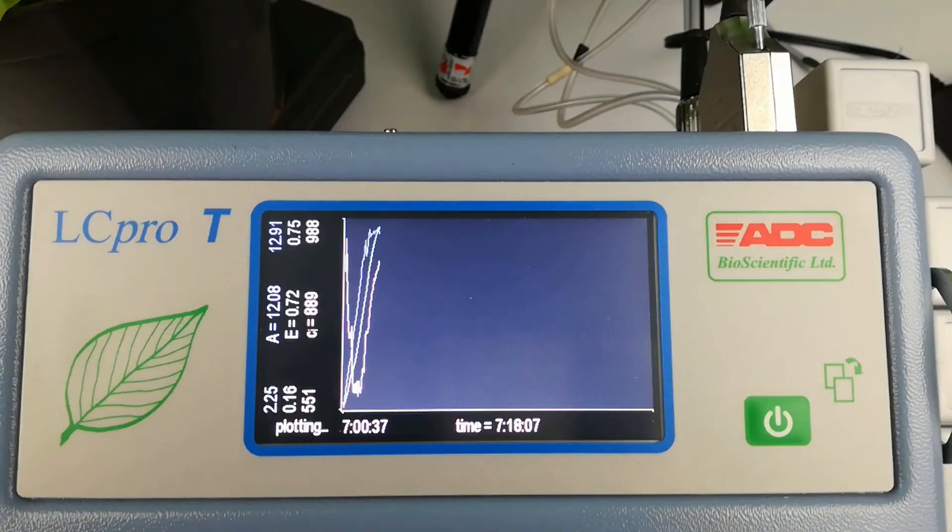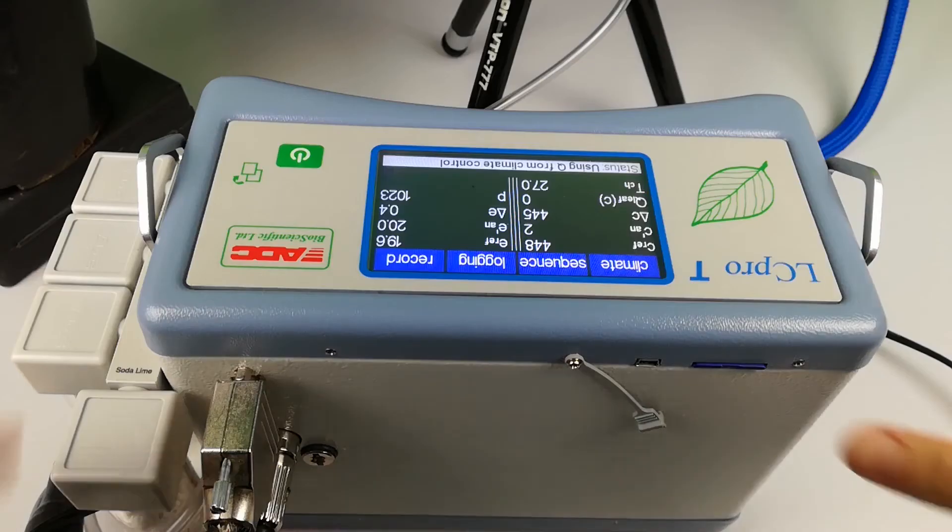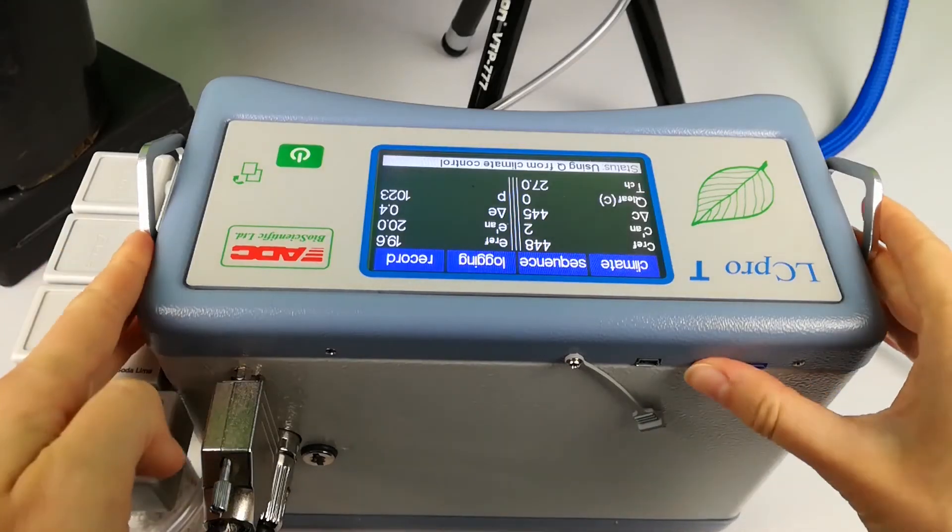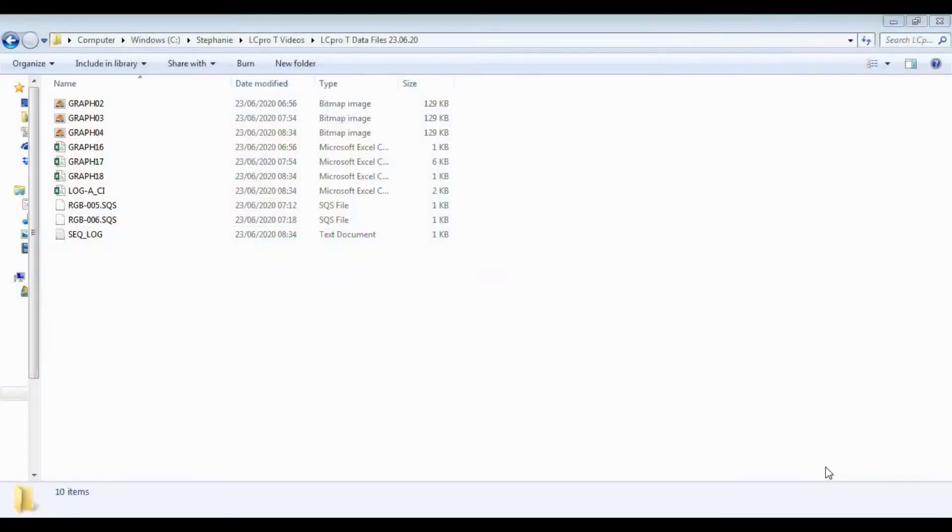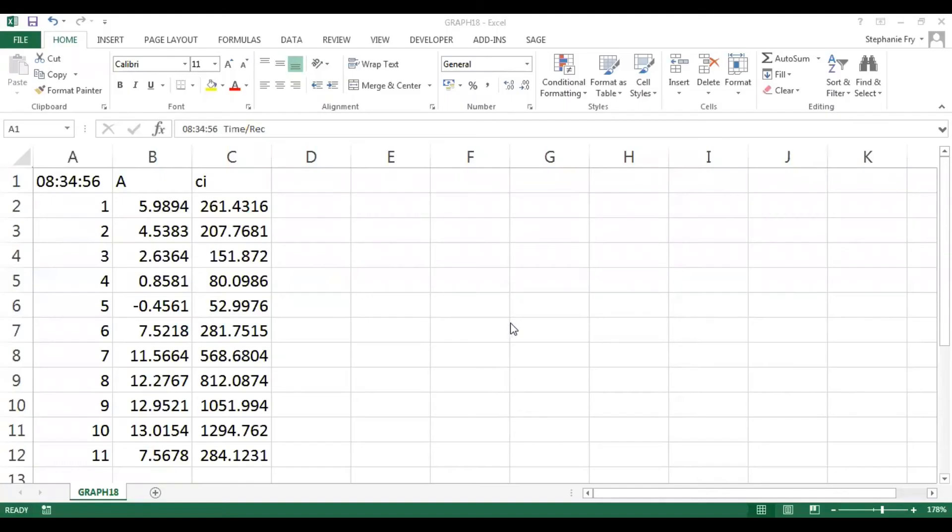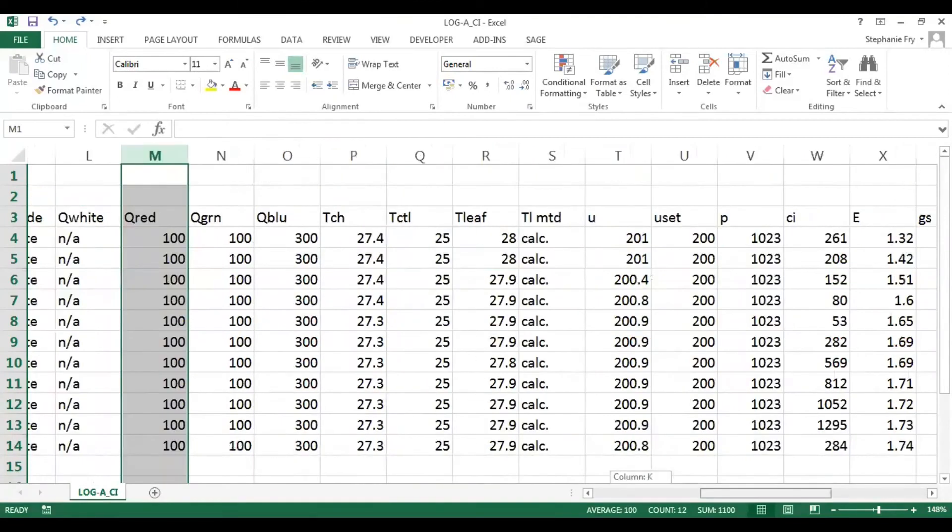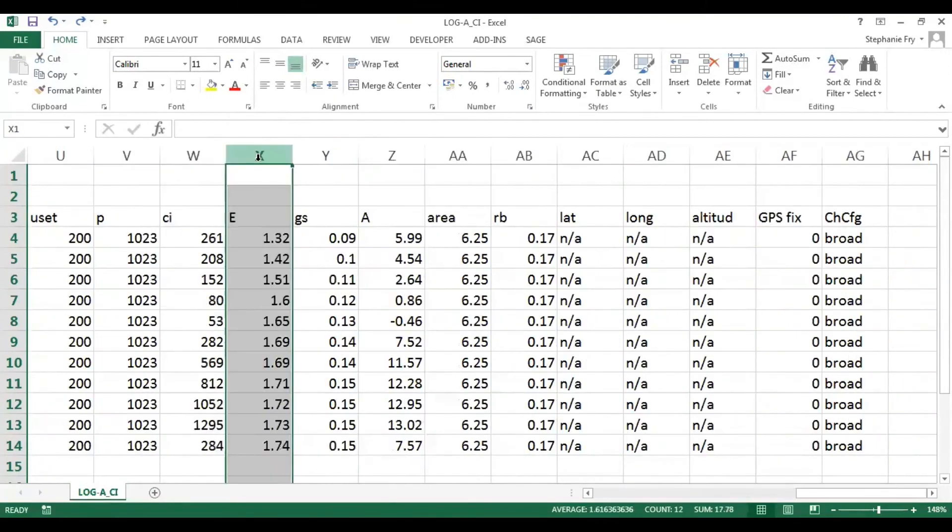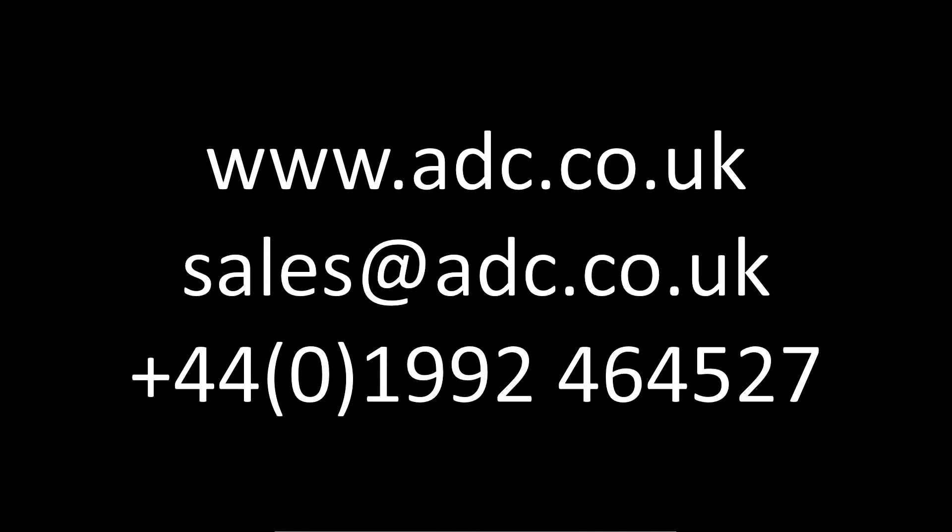All measurements, calculations and experimental programmes can be stored in files on SD cards. Data may be reviewed on the LC-PRO-T touchscreen LCD or downloaded to a PC via the USB port. So, let's go!